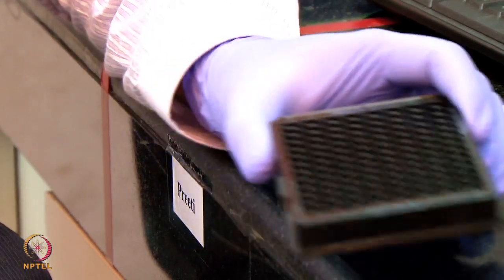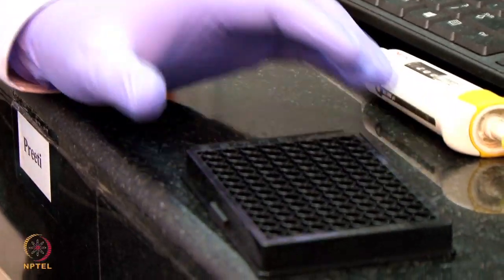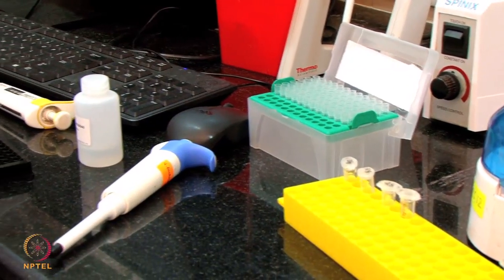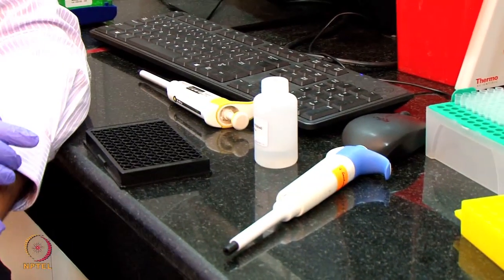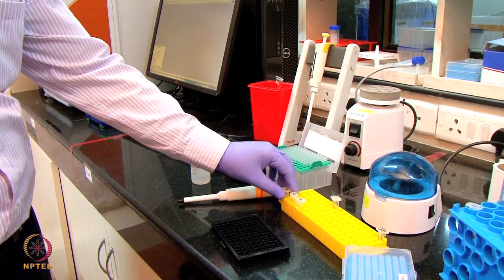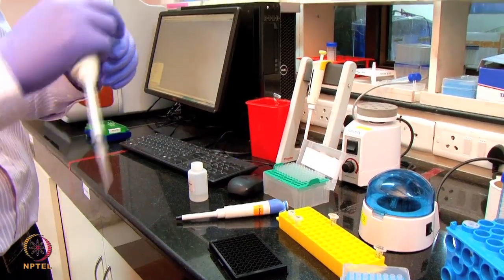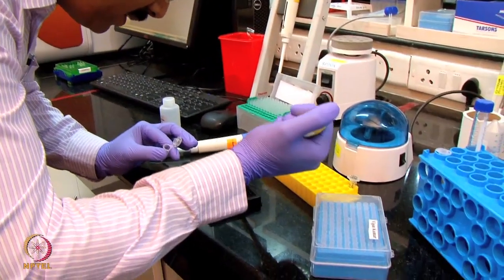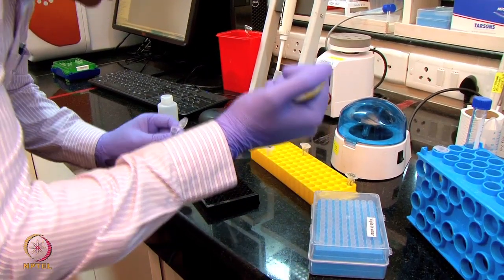Now I am going to add the unknown samples. We have 3 unknown samples here, which I am going to put in B3, B4 and B5. From these 3 unknown samples, we are going to determine the concentration of the unknown apolipoprotein using the standard. Now I am going to add the 3 unknown samples here. I am going to place the first at B3. This is sample number 1.